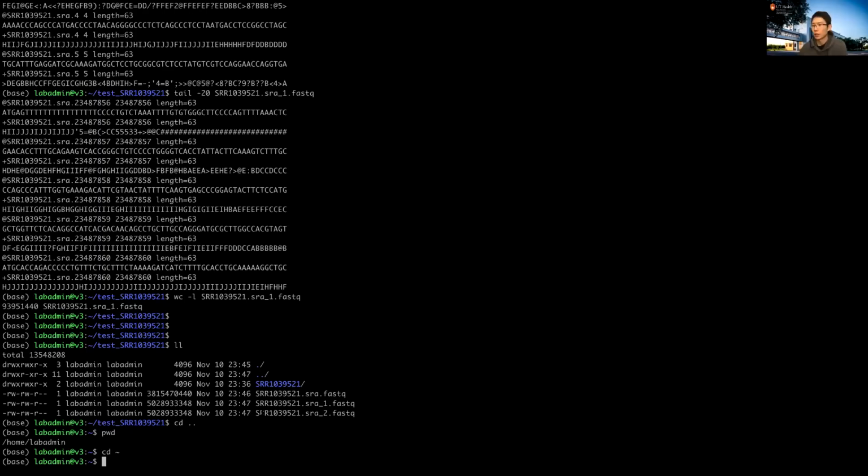Yeah, for the other sample I was trying the other day, I would say it's only about 5% of the size of the _1 and _2. So this one is supposed to be very, very small. That's why I guess it's something, as Henry said, probably not important, pre-filtered. And this one, I'm not sure why it's so big.